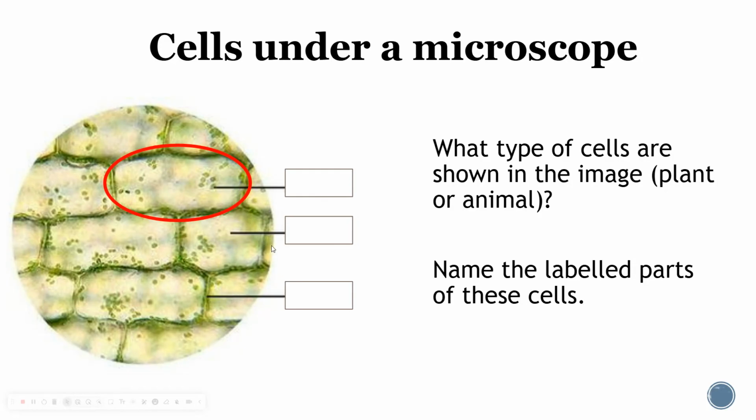So if you look at this here, this is an organelle that only plants have. And if you said chloroplast, that's correct. That's a chloroplast there. Here we're pointing at essentially nothing. So the big gooey jelliness in there, it could be cytoplasm. Some students sometimes say that if you cut the cell open, maybe you've cut the cell wall away, you're looking at the cell membrane, but you're probably looking at the cytoplasm there. And then over here, this arrow is pointing at the outside of the cell.